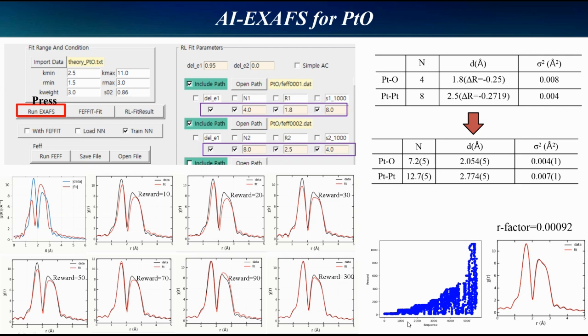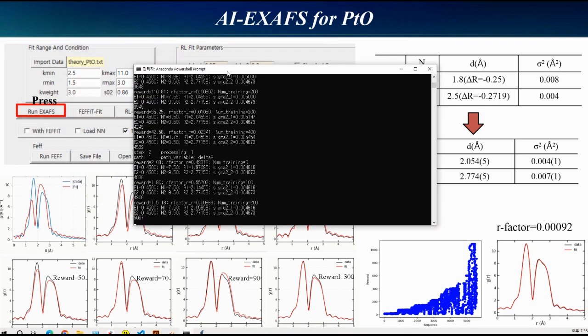Look, here's a sequence. This is the reward function of a sequence like this. And finally the graph of the result is this one.